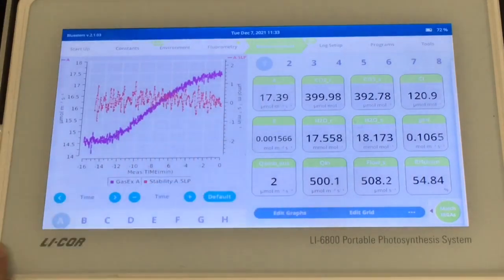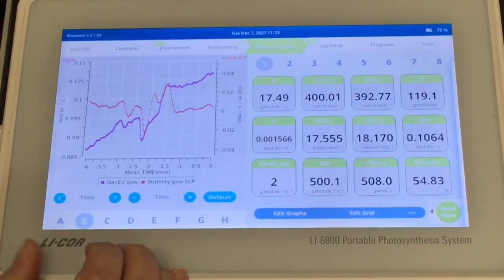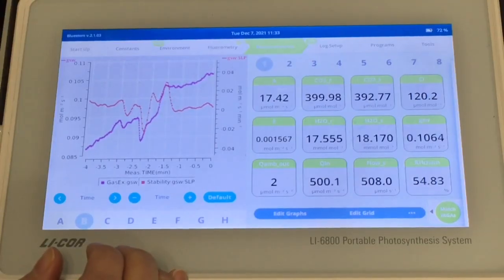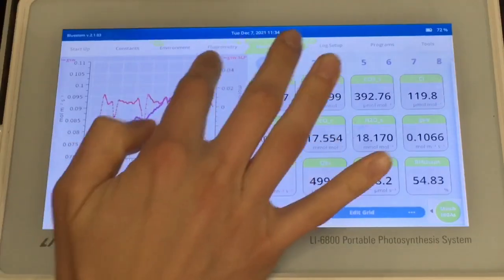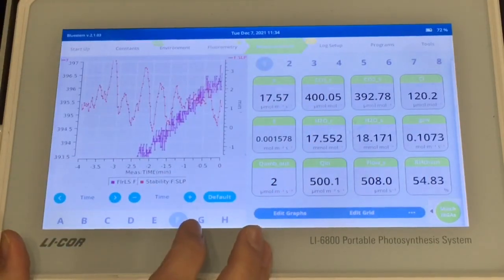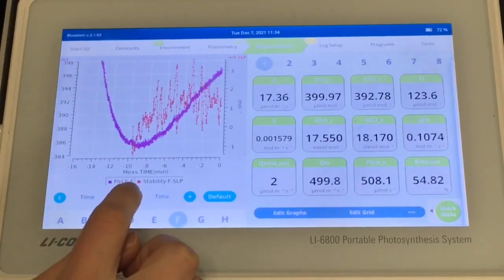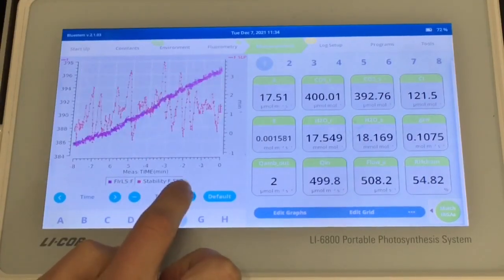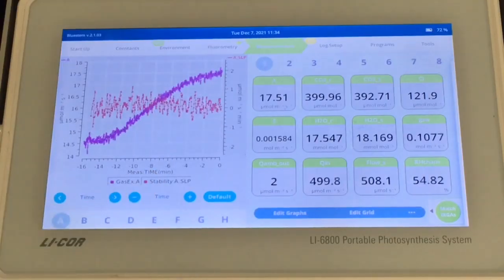Now what is my slope? Let me go look at conductance as well. So conductance is still sort of, let's see, let's zoom out here. Still kind of creeping up a little bit. And then what about our fluorescence? Okay, here it's also very zoomed in, so we'll zoom out a bit. Looks like it's still creeping up some. Still have to wait, be patient.